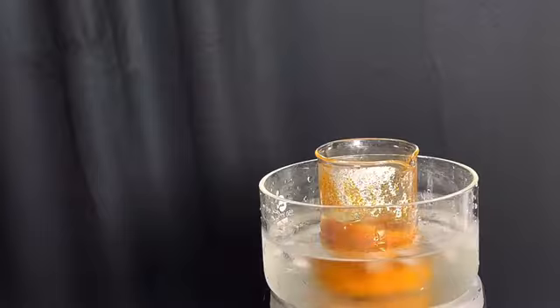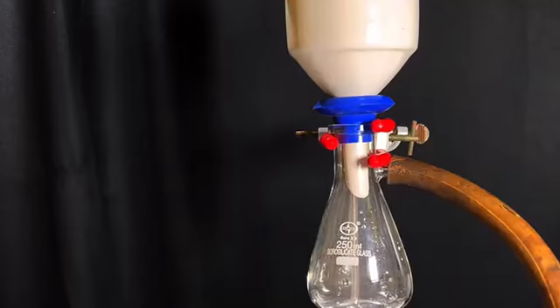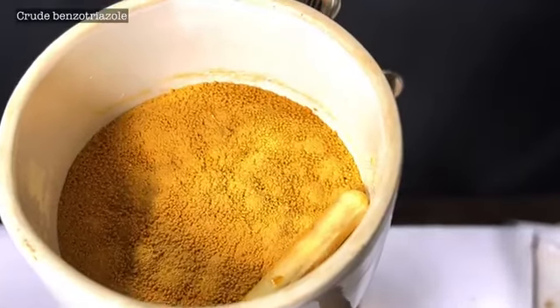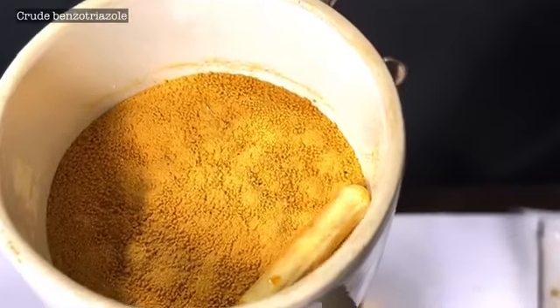The contents of the beaker were then stirred at a lower temperature and this causes the benzotriazole crude product to solidify from the viscous liquid. It was then vacuum filtered and dried. The crude product has a brownish yellow color to it.